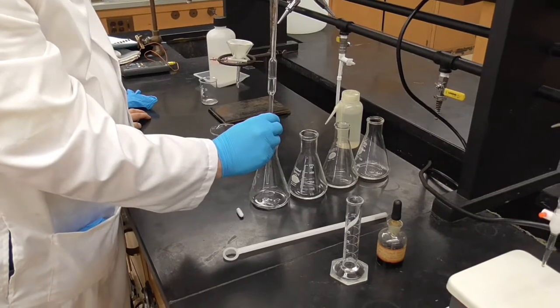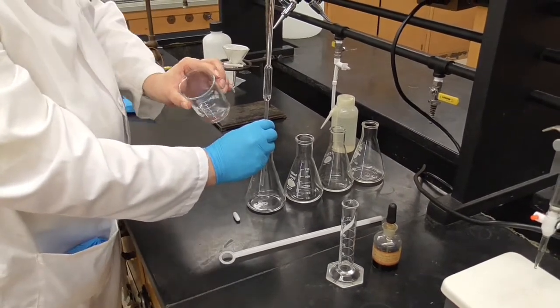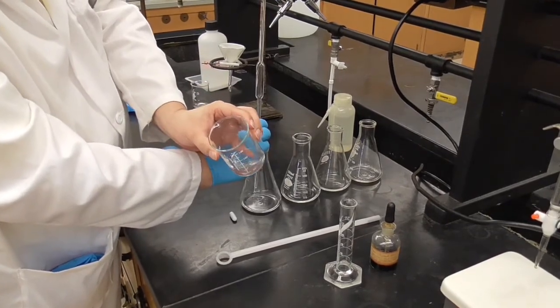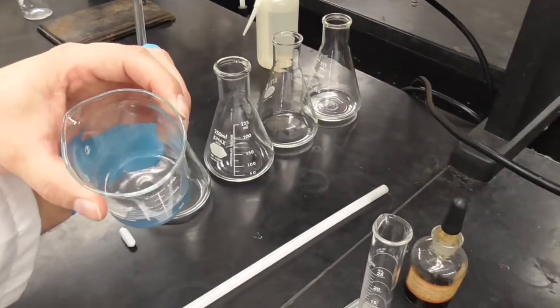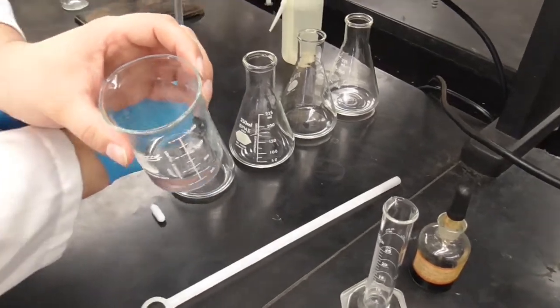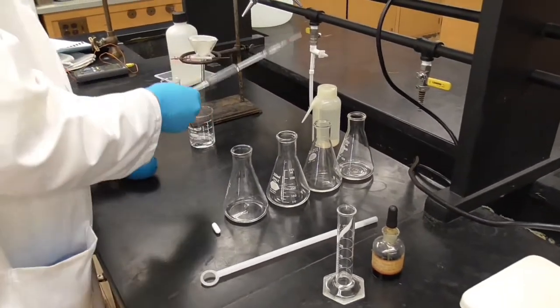So we had to do that relatively quickly because our solution, even after we filtered it, as it sits here, a little bit of the water evaporates and you're going to end up with more solid back down in there. I don't know if you can see that. There is a little bit of a film starting to form, and we don't want that to happen. So we pipetted it as quickly as we could.